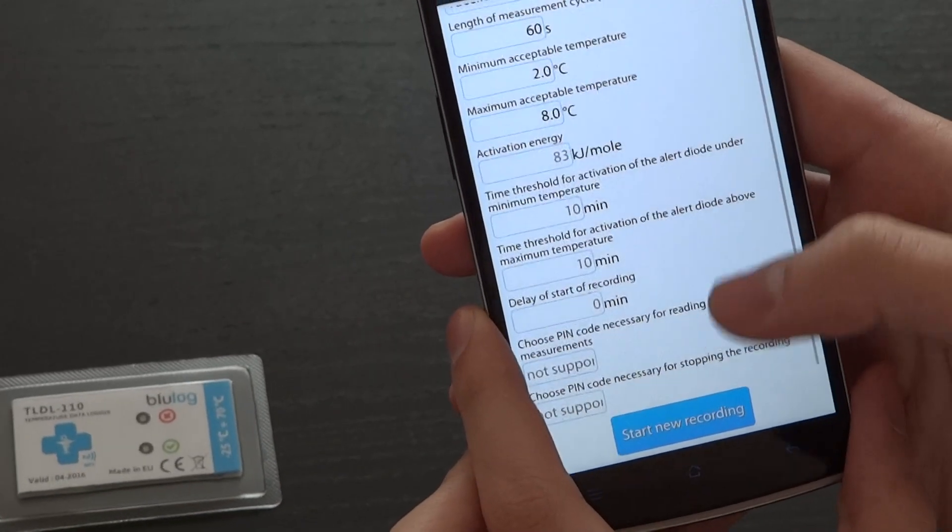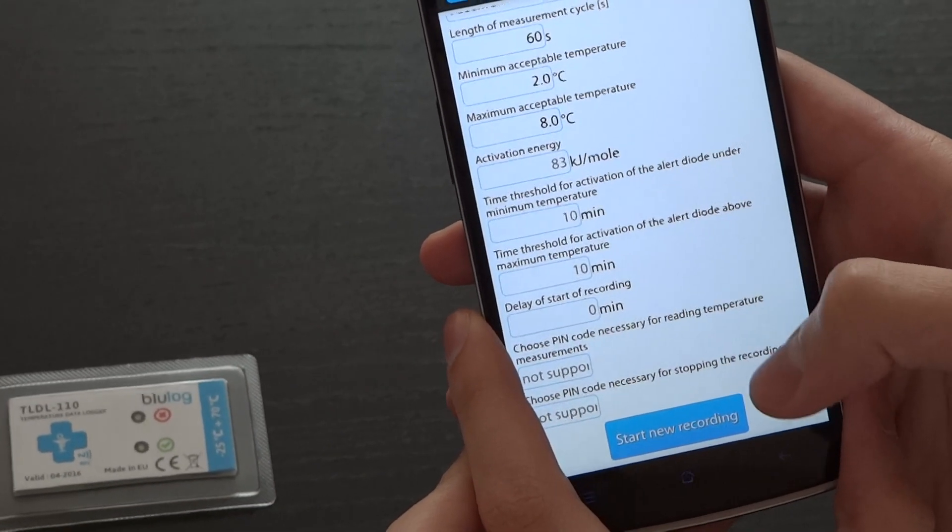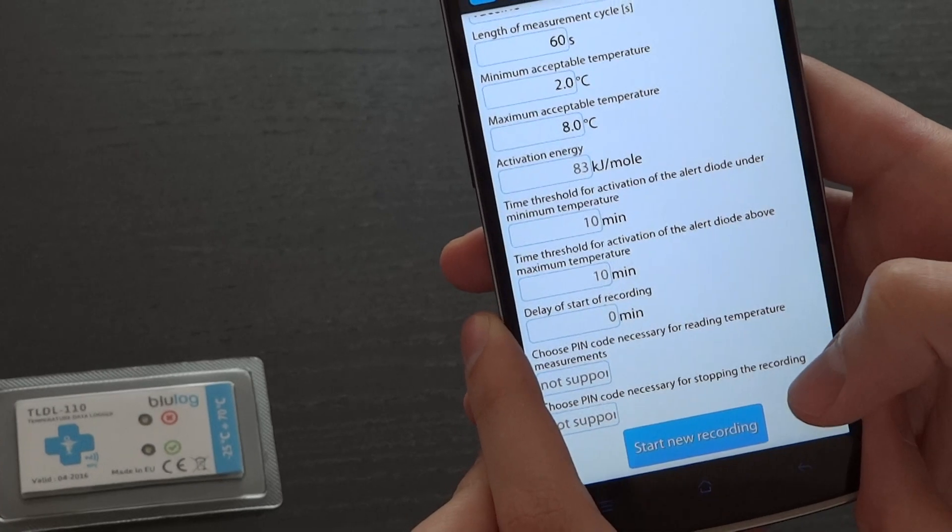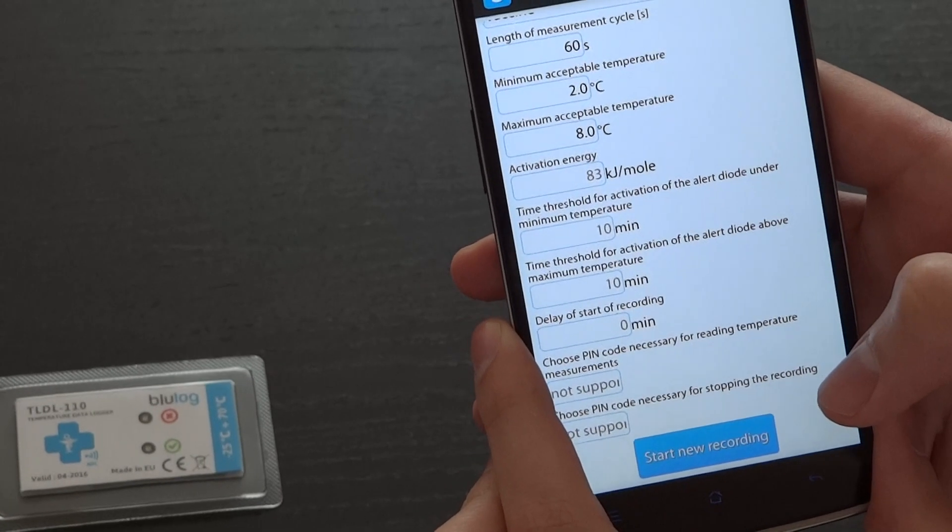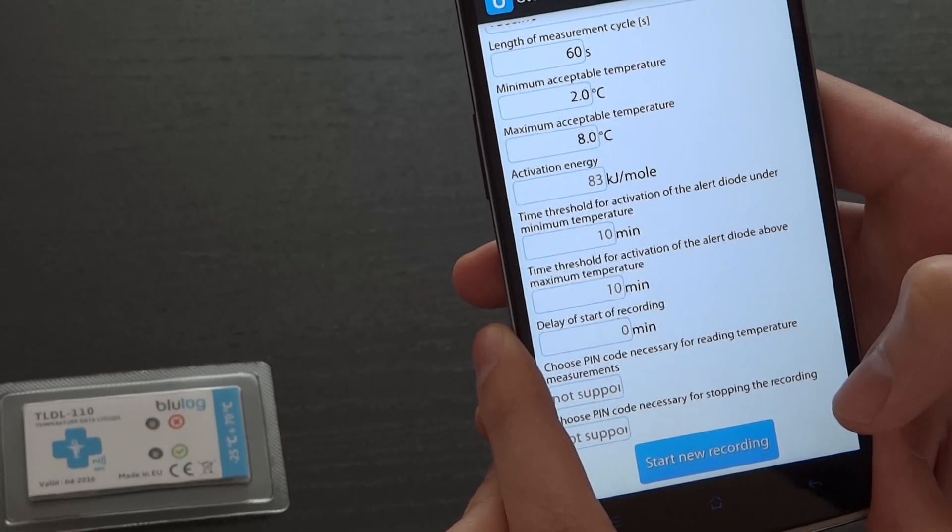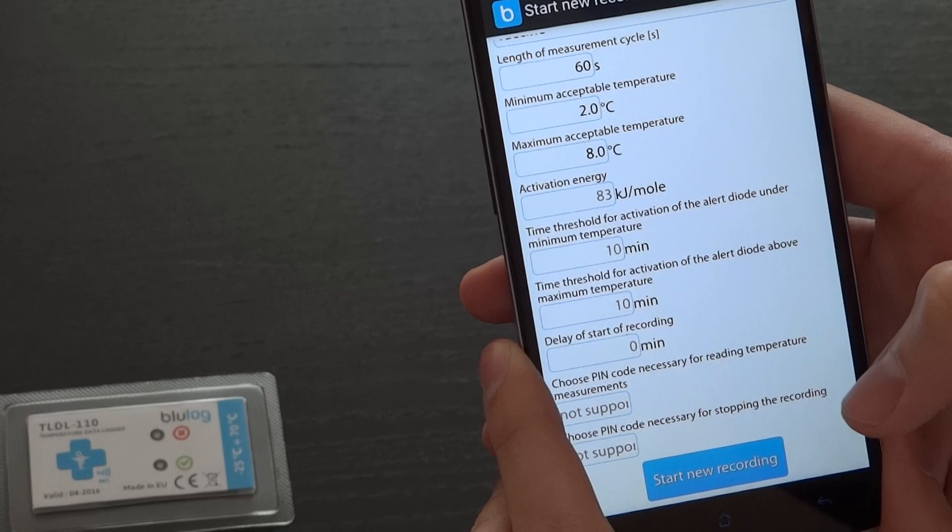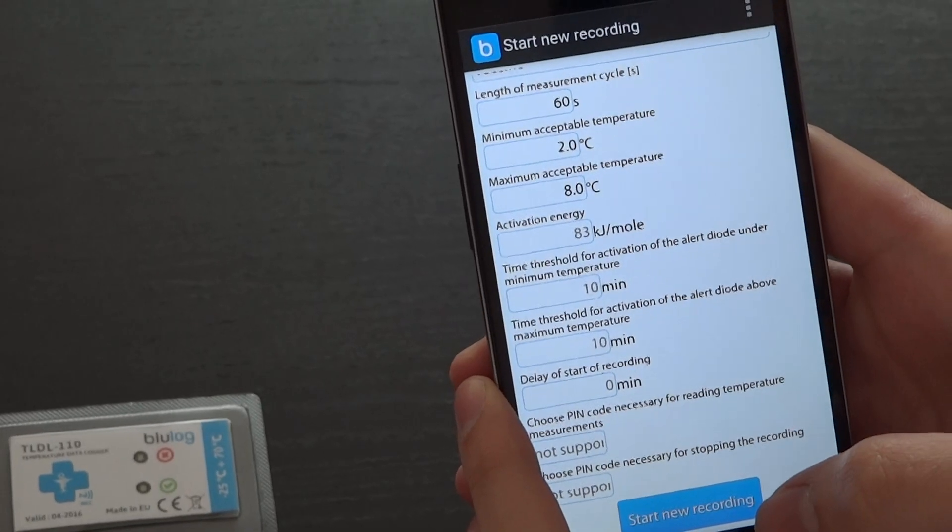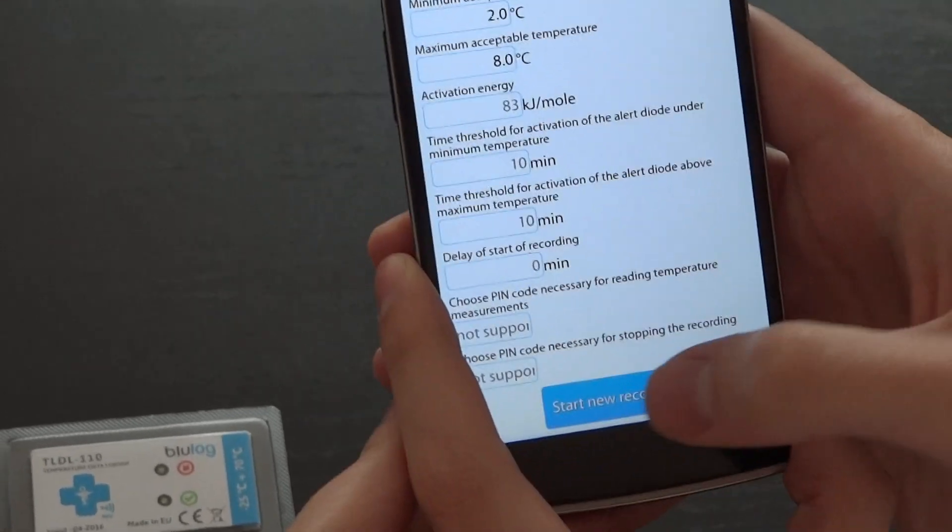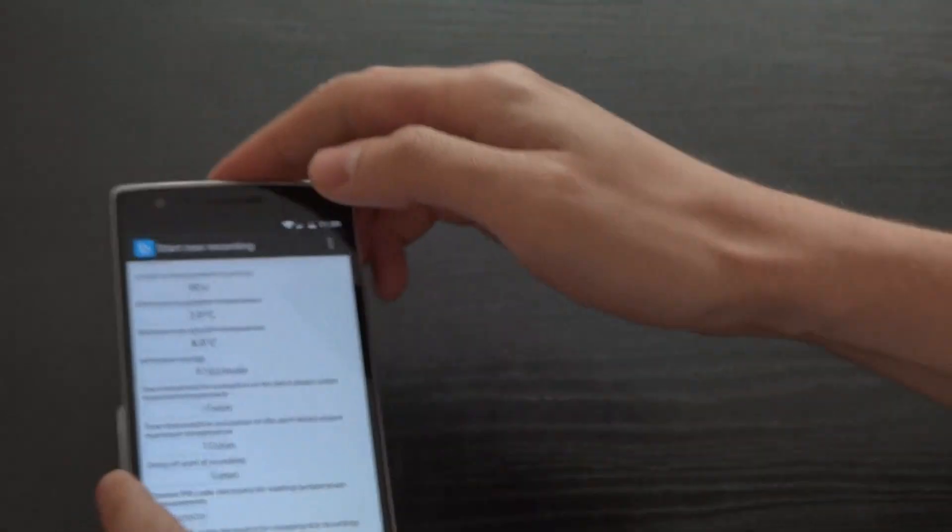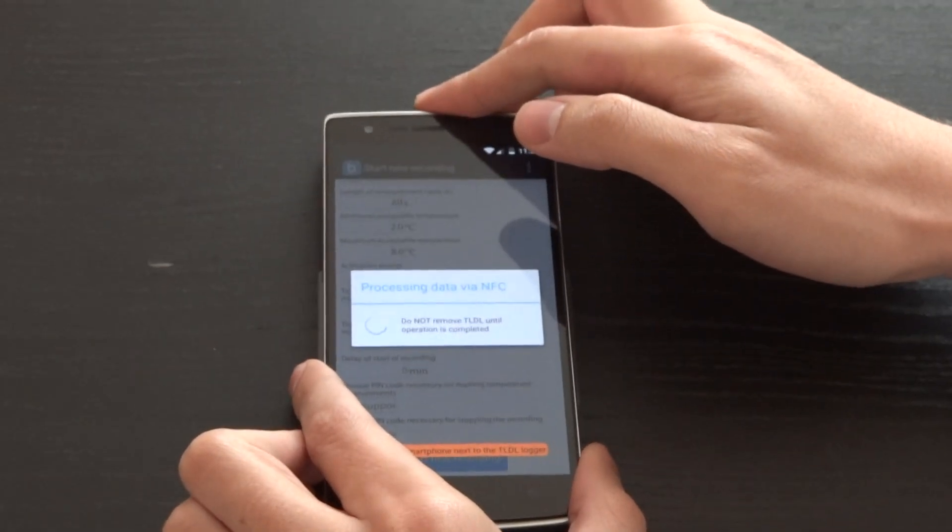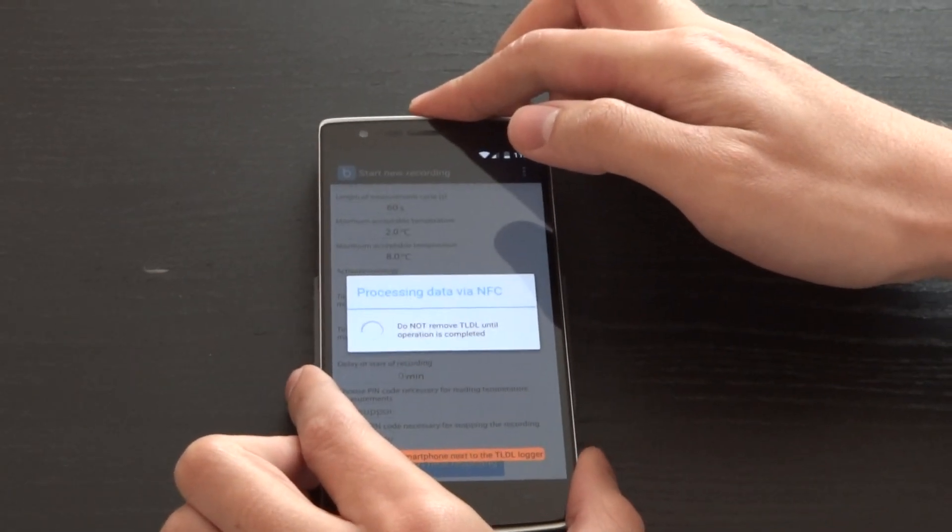You can delay the start of recording and choose pin codes which would be used to protect against reading of temperature data and stopping the recording. To start the recording, press here and place your smartphone next to the logger.